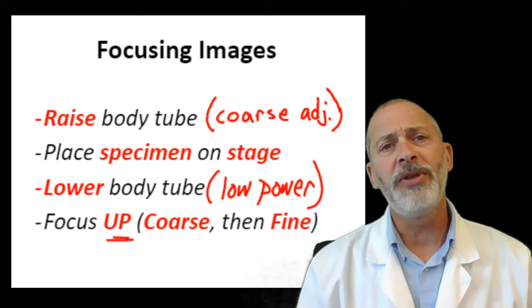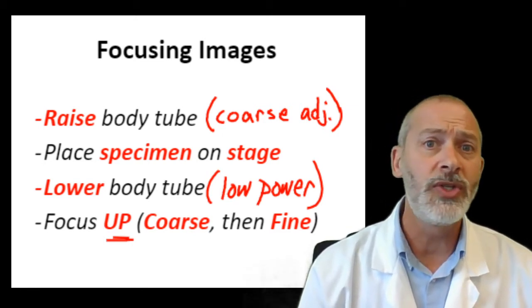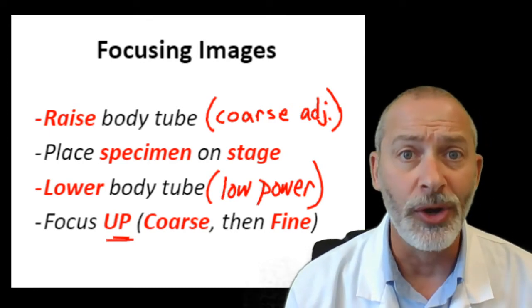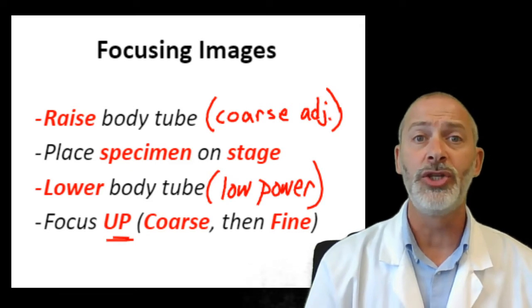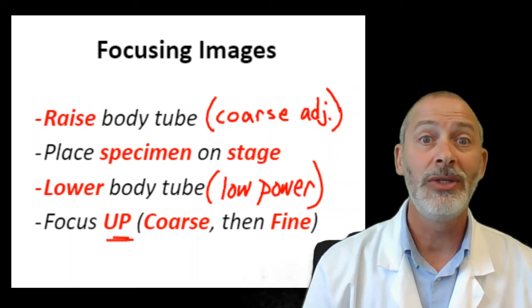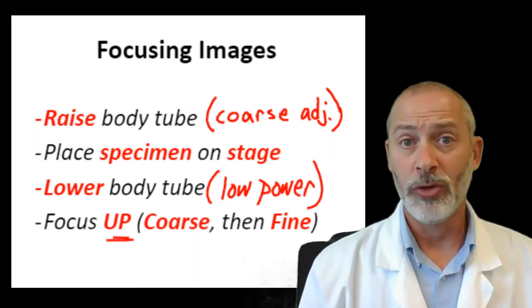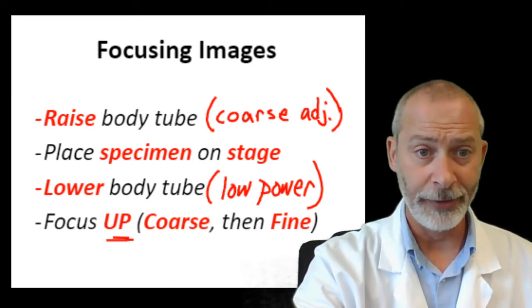Which makes me think of something else. Some of you might wear glasses when using a microscope. You don't need to wear glasses at all because you are going to be focusing the image for your individual eyesight. Nobody else's but yours. And no matter what your eyesight is, you'll be able to focus it for you. So that's a good thing.